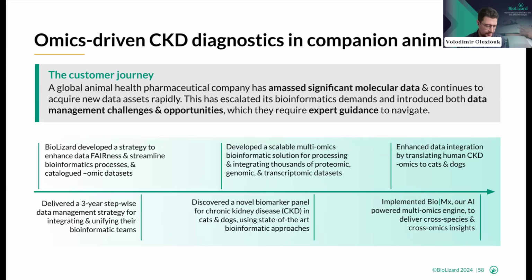And we can go beyond that concept, looking at, for example, flow cytometry, which was mentioned, but also MS-based proteomics, transcriptomics, and so forth. And the promise of multiomics is that when you combine those different pieces of the puzzle, you will create a complete picture of biology, whereby you will have an increased understanding. So more than just combining those pieces of biology, by combining those different omics, you would be able to get new insights that you will typically not be able to have when you're just looking at those different puzzle pieces.